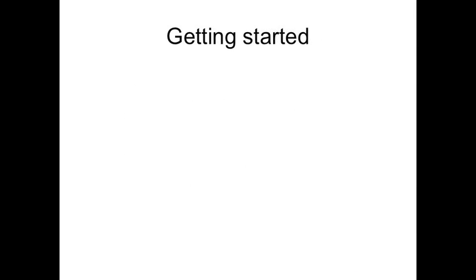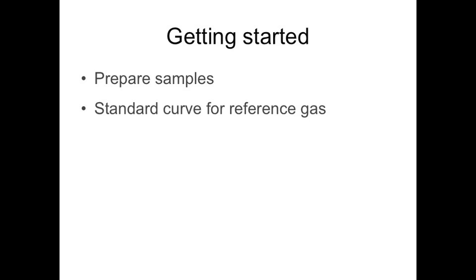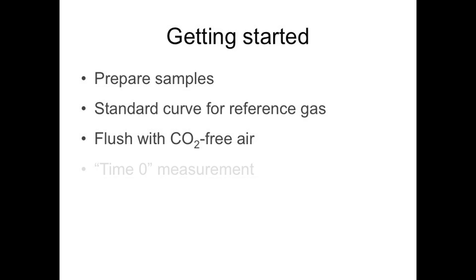Let's get started with our incubation. To begin, we'll prepare our samples, create a standard curve for our reference gas, flush our samples with CO2-free air, and take a time zero measurement. We will start by weighing out our soils and adding the right amount of water to each one.